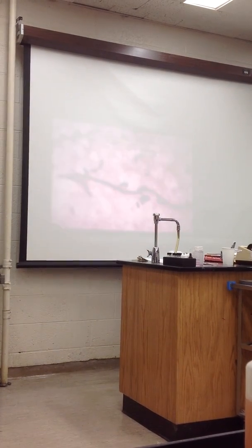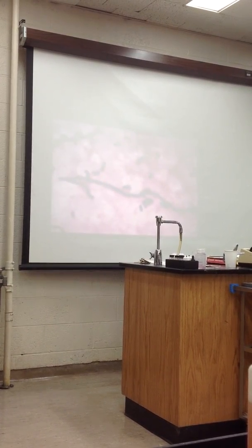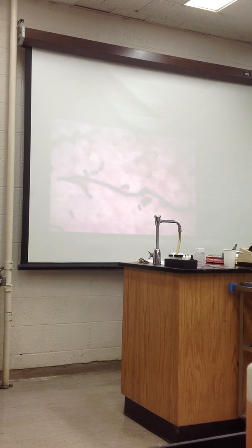This is a sort of hyphae. Then you'll find that Candida albicans can form this type of hyphae. You have some budding yeast. But that's not a good slide.